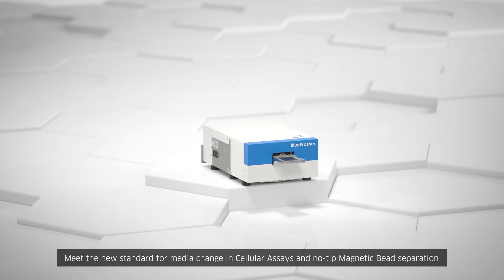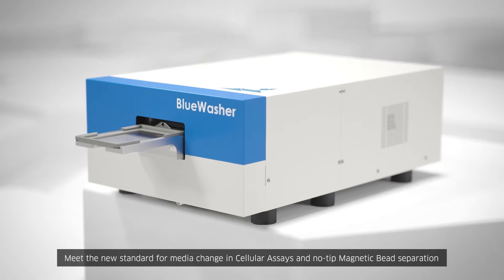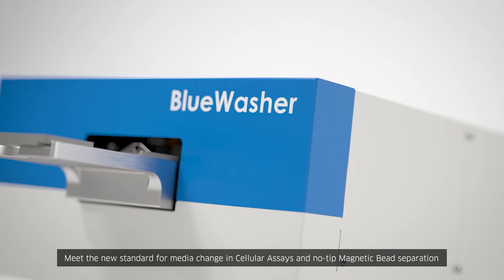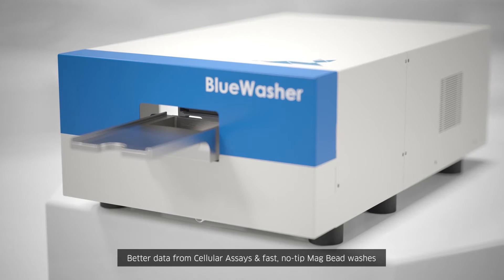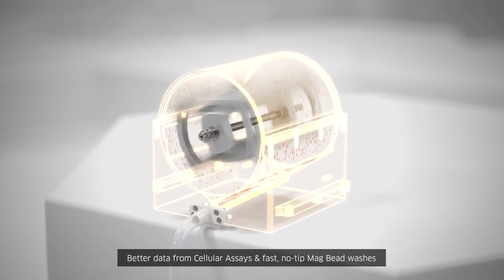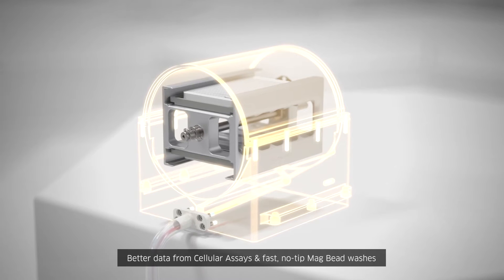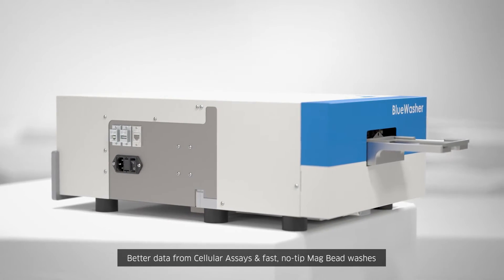Since winning the SLAS and MIP-TECH New Product Awards, Blue Washer has become the new standard for media change in cellular assays and fast, no tip, no bead loss magnetic bead separation. Blue Washer's highly reproducible centrifugal plate evacuation reduces residual volumes, dramatically improving background and variability in cellular assay data, while eliminating tips and bead loss and speeding up magnetic bead separation.